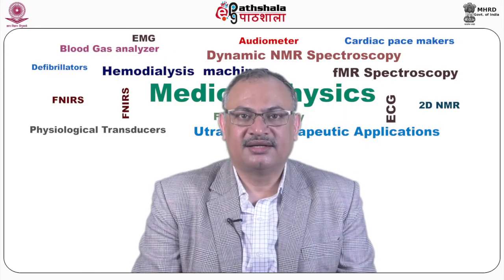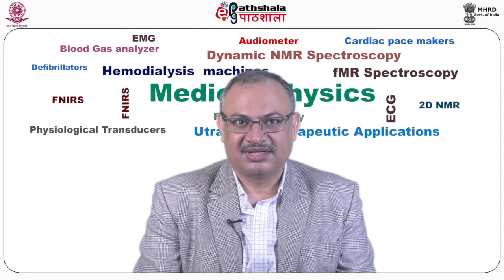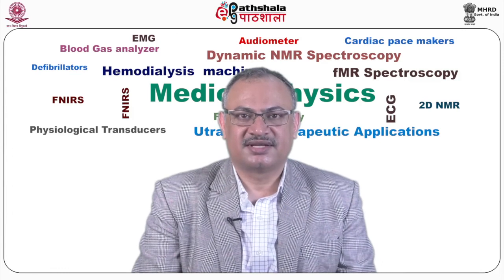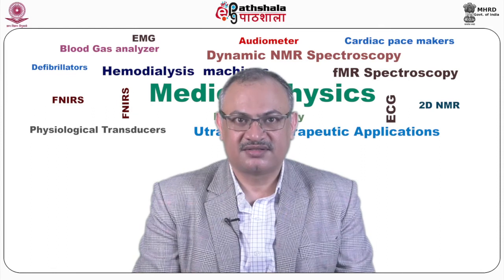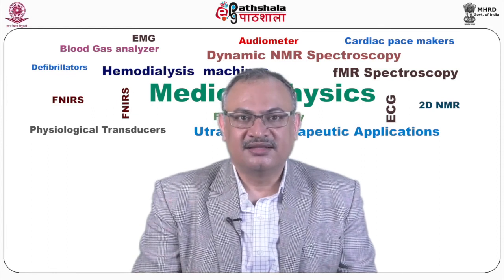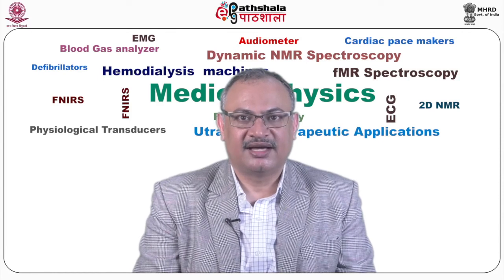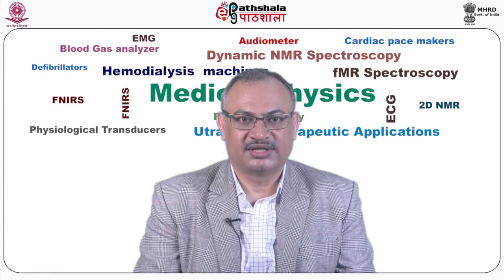Let us now look at the N15 edited NOESY-HSQC experiment. In this 3-dimensional experiment, magnetization is exchanged between all hydrogens within 5 angstrom distance through the NOE. Then the magnetization is transferred to neighboring N15 nuclei and back to proton for detection. So, this is the HSQC component.